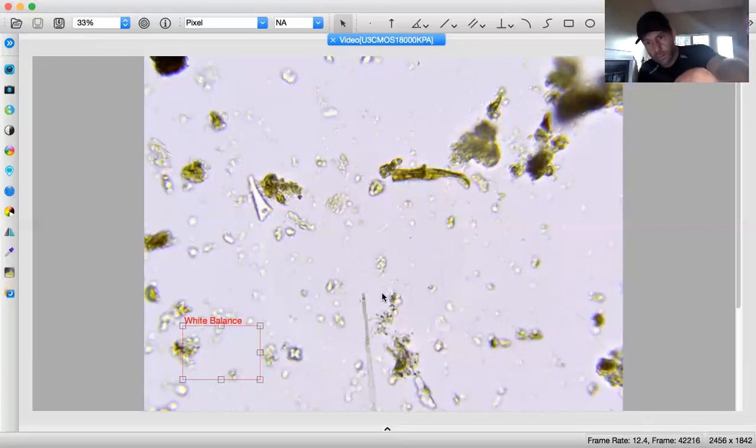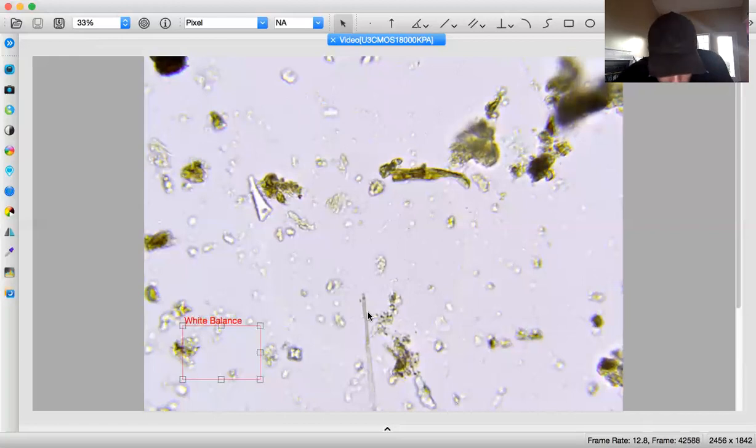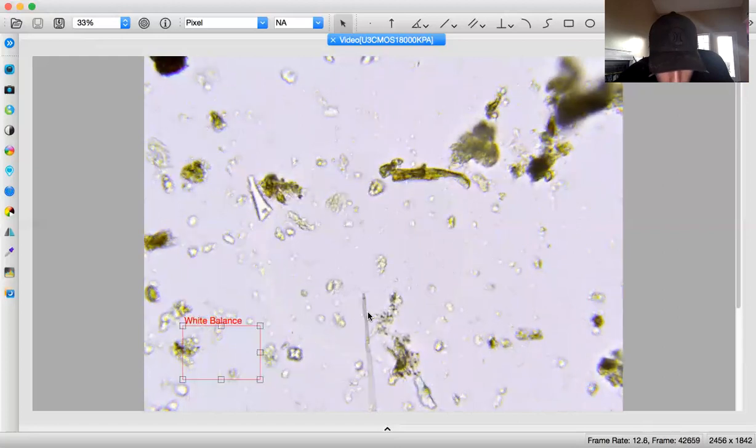2, 2.5, 2.5, 2, 4, and 5, 6. Yeah, 6. I got it twice, so that's what it is. 6.6 is where we're at. And let's see, this guy down here is looking like 2.5. I'm going to go ahead and put 2 in here. What is it? Actino is the question. I do not see septa, and it is the size of a bacteria.